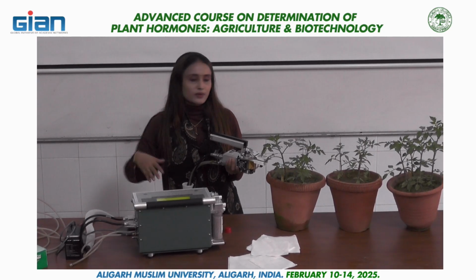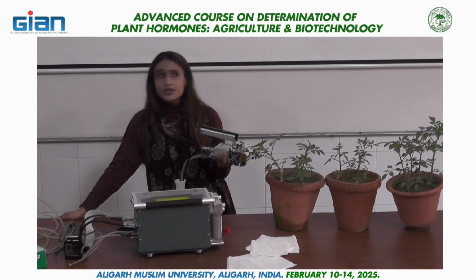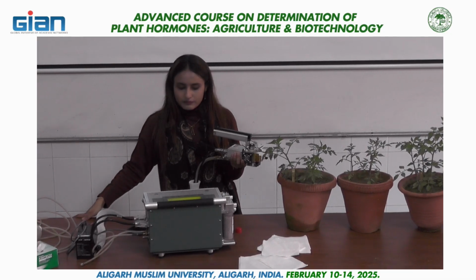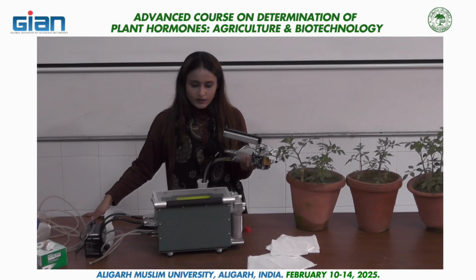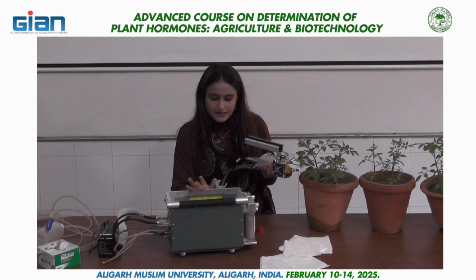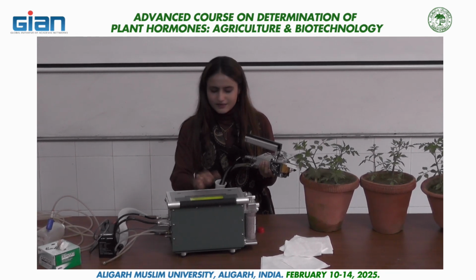As readings are fluctuating, obviously we will not get the readings we can get in field condition because there is no sunlight, and on the sensors we have no sunlight here. For example, now we are getting the photosynthetic reading as 13, so we can take this as the reading.